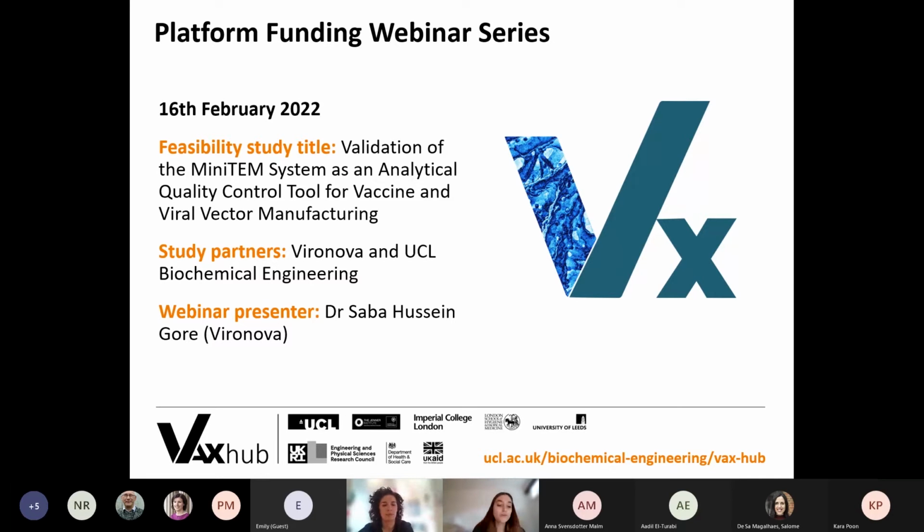So today's webinar is on the validation of the MiniTEM system as an analytical quality control tool for vaccine and viral vector manufacturing. It will present results from a collaborative hub-funded feasibility study that was awarded to Vironova and UCL Biochemical Engineering and conducted with the support of the UK's National Physical Laboratory. This webinar will introduce you to a validated negative stain transmission electron microscopy analytical method using artificial intelligence with acceptance criteria for analysis of virus-like particles, or VLPs.